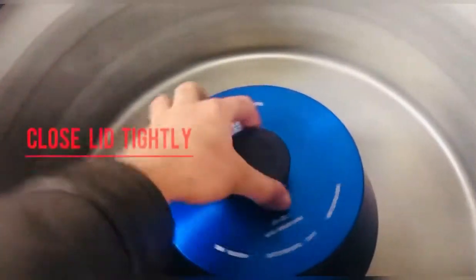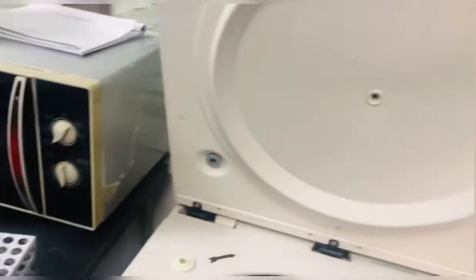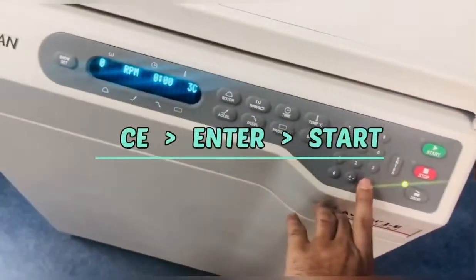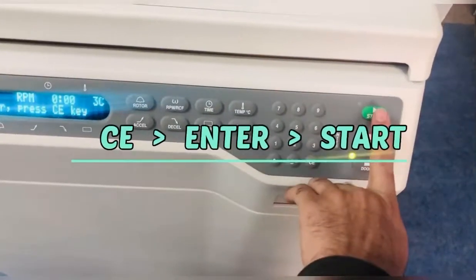Otherwise you may have an exhaust issue. Simply close the lid. To start, just press CE, then Enter, and then Start.